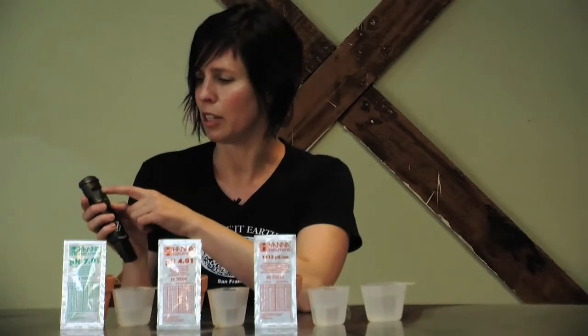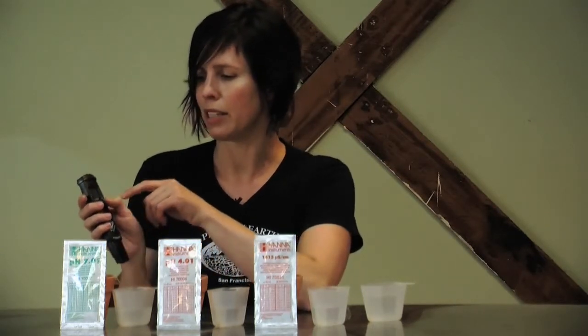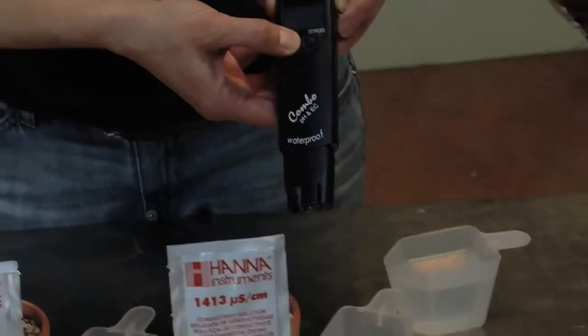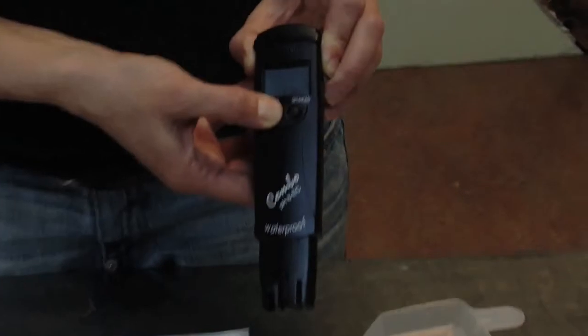To do this, turn the pen on. Make sure you're in the EC mode by pressing the right-hand button to go through and land on that mode. Then press the power button and hold it until it says Cal.